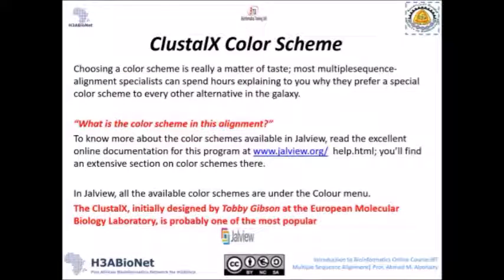And the coloring scheme, as we will see later, Jalview has many coloring schemes, including Clustal X, and this is one of the good coloring schemes that I prefer to use, and it is understandable for everybody. But if you want to use another coloring scheme, there are many others, as we will see later in the lecture.